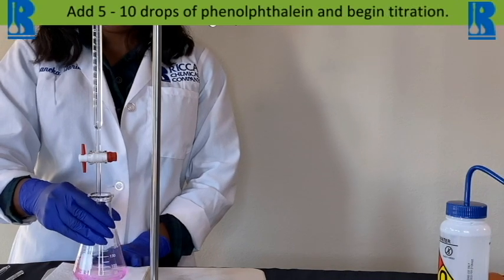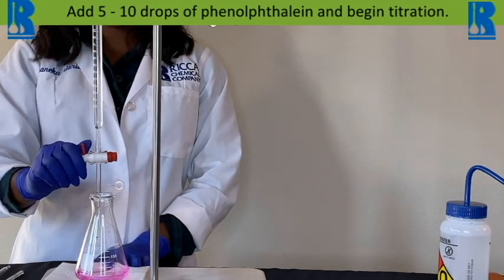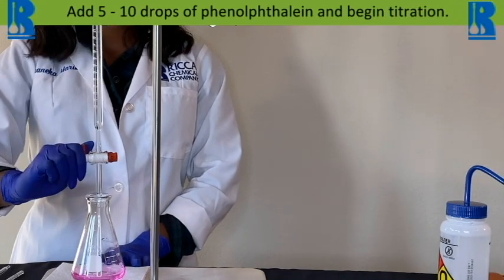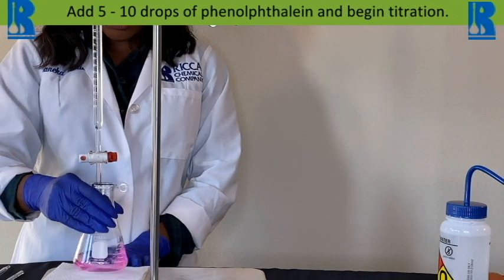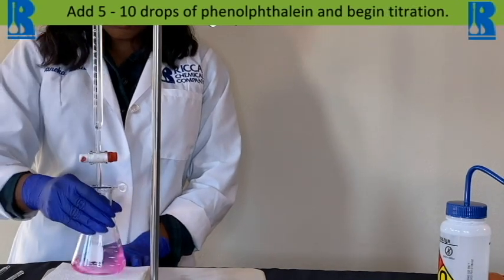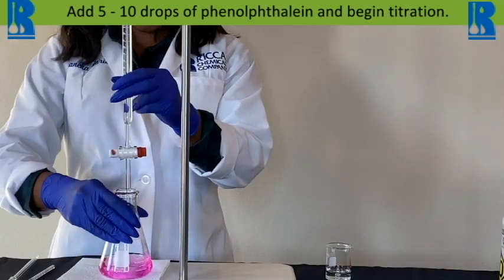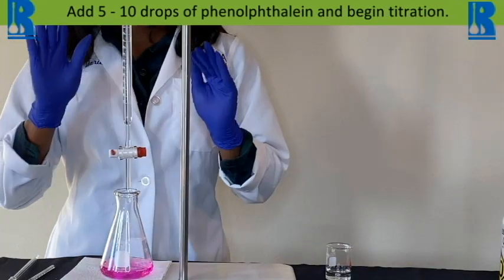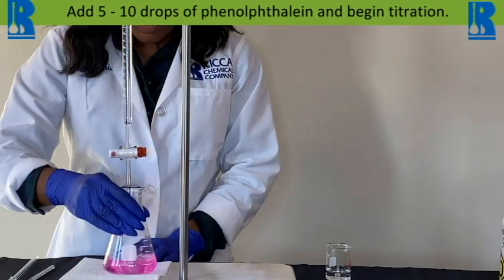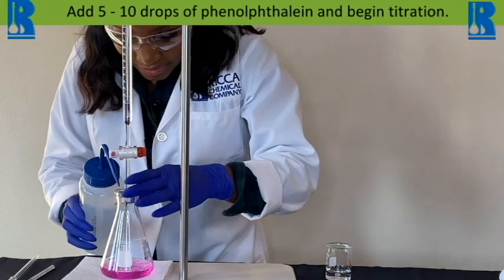As I near my endpoint or my expected endpoint, I'm going to slow down because we do not want to over-titrate. You can slow down by opening and closing the stopcock. Because we're getting really close to our endpoint, it's really important to slow down. We can also do a little rinsing of our sides too.